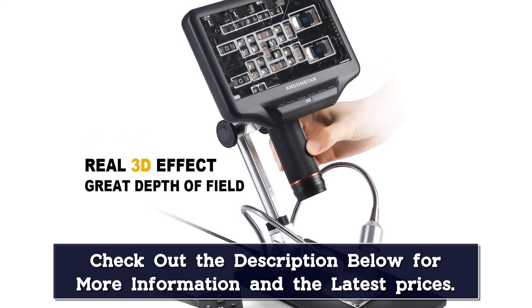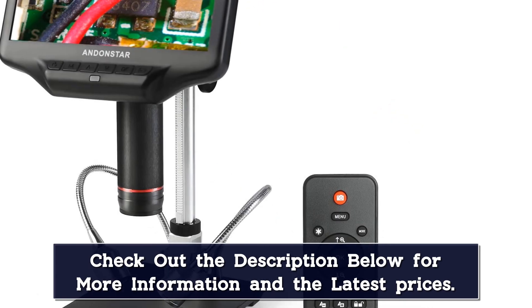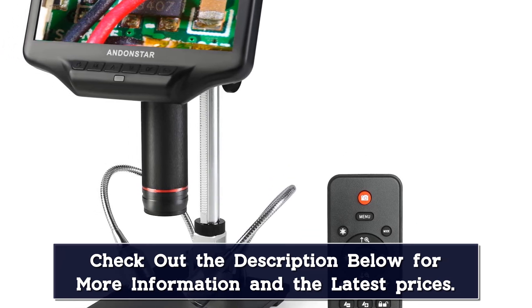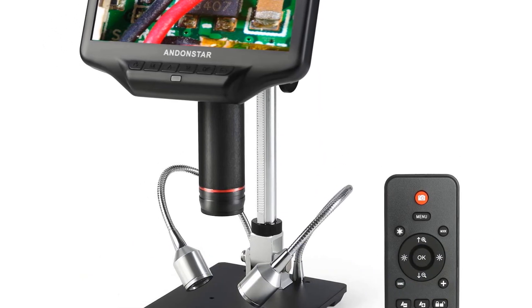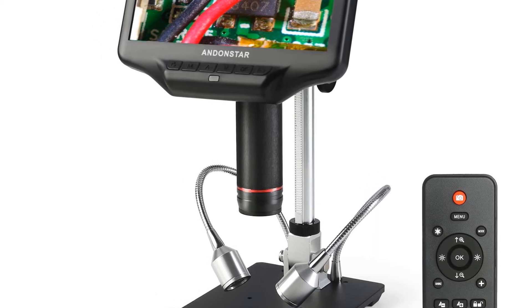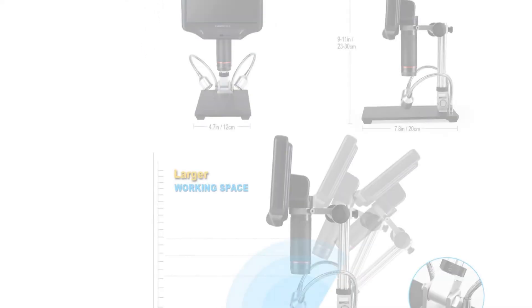Settings include resolution, frame rate, time stamps, contrast, color temperature, and more. The image quality itself is excellent, so the device offers a lot in this regard. All features are controllable through the buttons under the display, but you can also use the included infrared remote. This comes in particularly handy when recording images and videos, as any movement from pressing the display buttons leads to a blurry image — by using the remote, you don't have to worry about that.